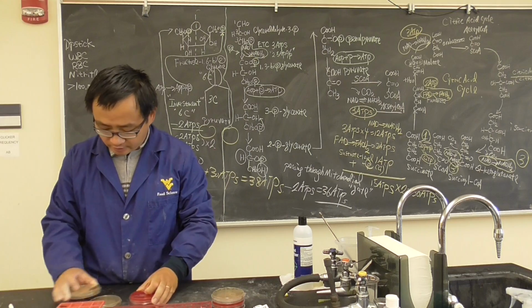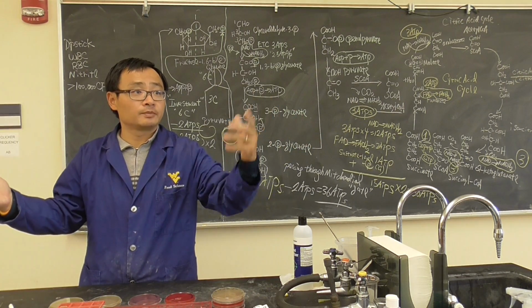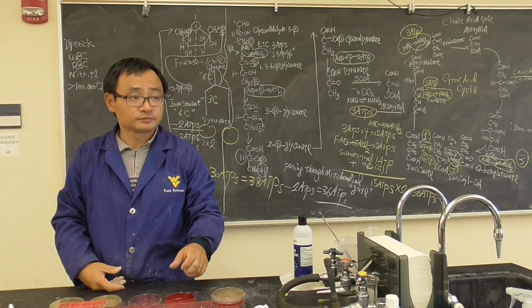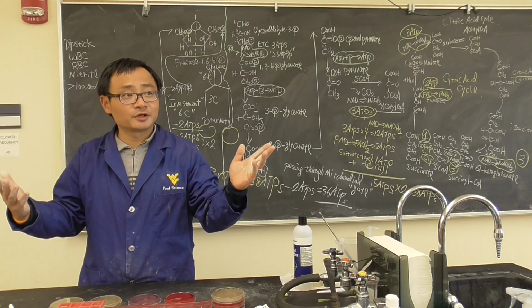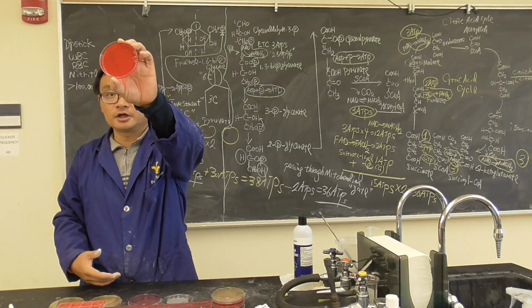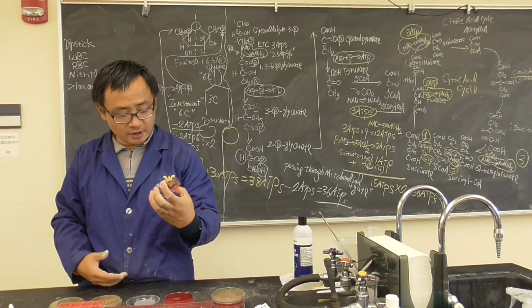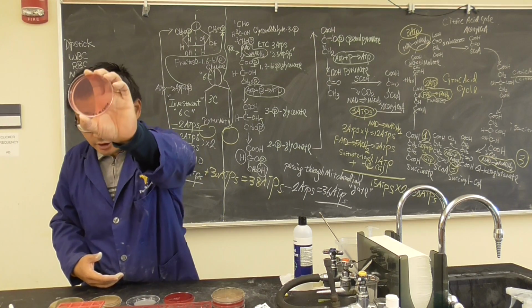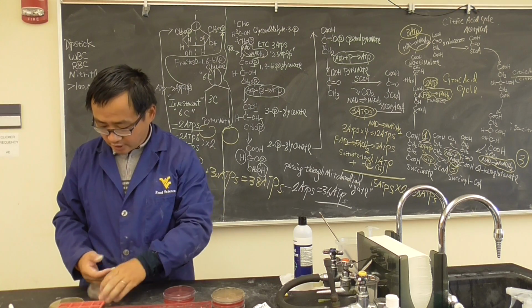Okay, what we find? Dipstick, you just do by yourself. I'm assuming it's not positive, like white blood cells and red blood cells. Oh, there are some red blood cells and white blood cells. There's some colony here on the blood agar, and I don't think there is anything happen on the MacConkey agar. Okay. How about the count here?